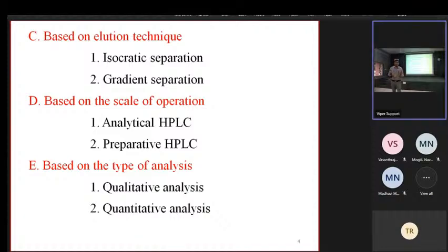Because the pharma industry spends some 25 to 30 lakhs on an instrument, we cannot develop a method taking 1 hour for each molecule. You have to develop a method with better separation within 4 or 5 minutes, as short as possible. Then only can the chemist handle 50 samples daily on one instrument. Otherwise, you can only do 10 samples per day if you sit for 1 hour per sample on an instrument.